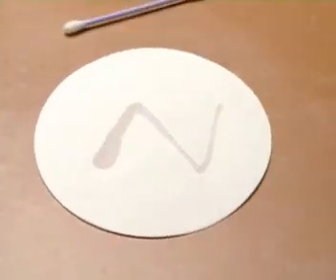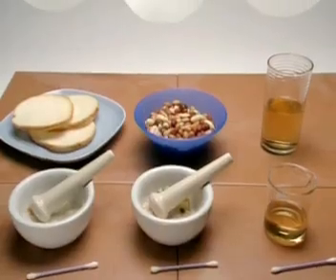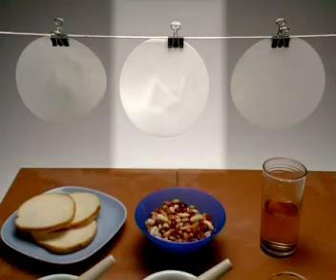They all look translucent to start with because they're wet, so it's important to leave them to dry for a few minutes. Here are the results: only the nuts contain fat.